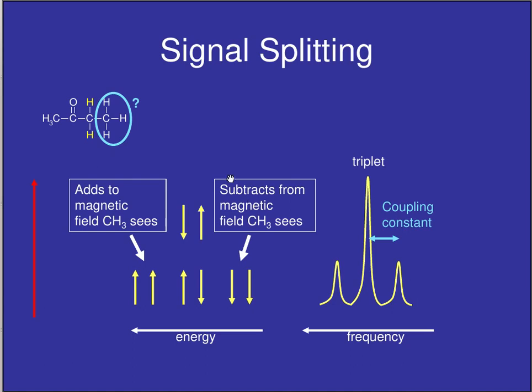This gives rise to this methyl group having this appearance over here, with a higher frequency due to neighbors both with, and a lower frequency both against, and a large proportion unchanged, due to the half of the sample that does not change the frequency or the magnetic field of that methyl group.